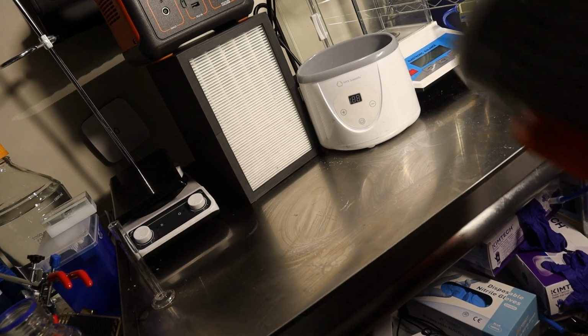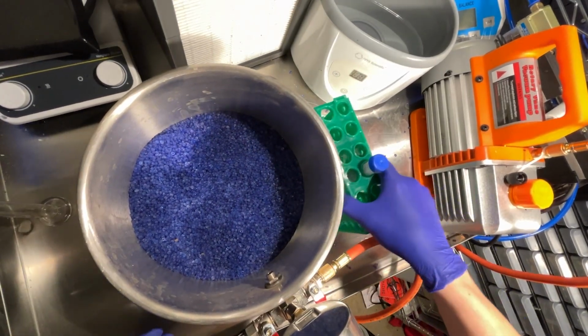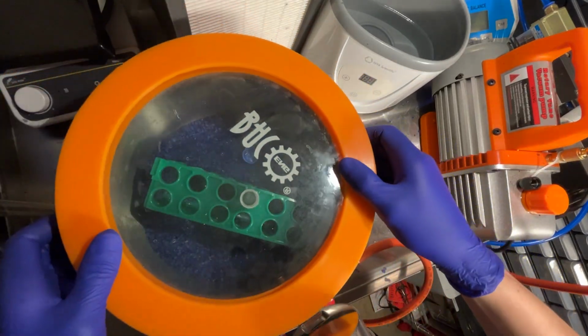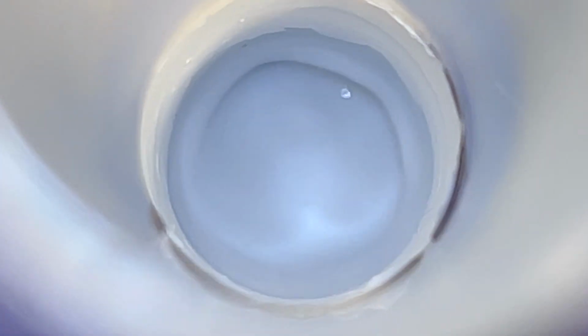It was now time to dry the product, which I daringly decided to do under reduced pressure in a vacuum chamber, this time being much more careful. I put it in the vacuum pump and removed the air, allowing the acetone to more quickly evaporate, which was really cool to see. The desiccant was releasing a lot of steam because I microwaved it, condensating on the side of the tube while the acetone evaporated. This worked surprisingly well. So yeah, there's definitely still liquid in there, but it's very reduced.